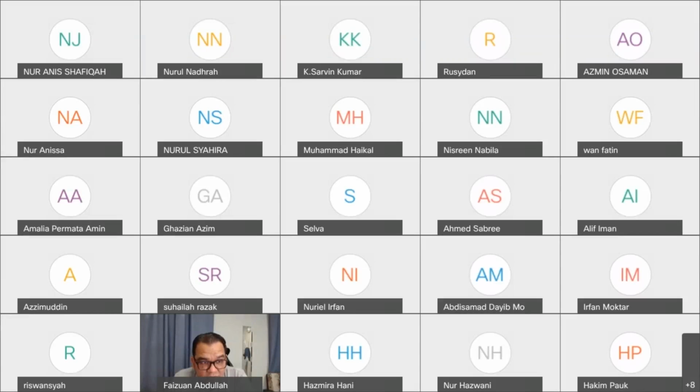Means natural. What is natural? What do you mean by natural? Can anybody give me the basic idea of organic? We are now learning about how to analyze the organic analytes using chromatography methods. So explain to me what this basically means in your own words. What is organic?